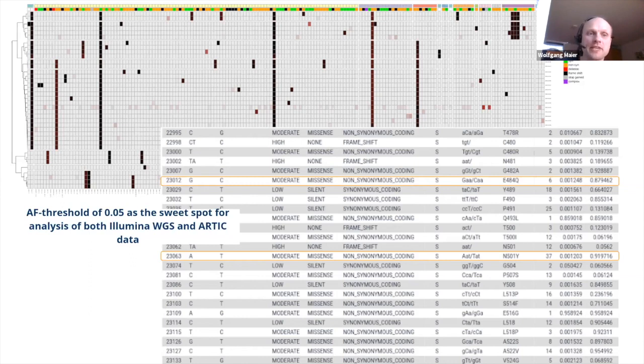And then you can also quickly identify samples that are maybe not such good quality. Like you see this one row where there's a relatively high amount of low frequency variant calls, a lot of light pinkish color in that one row horizontally. This is probably a sample where sequencing quality was just not so great, and so the variant caller picks up a lot of false positive variant calls. So that's a quick way to spot an outlier sample which is not good quality.